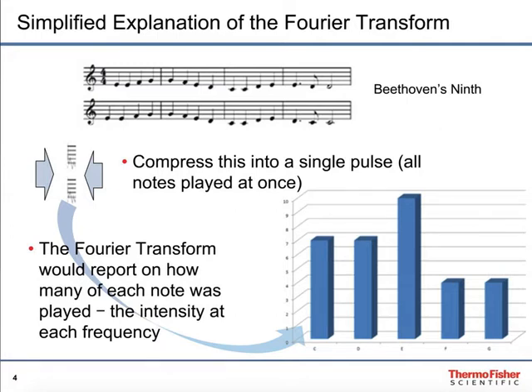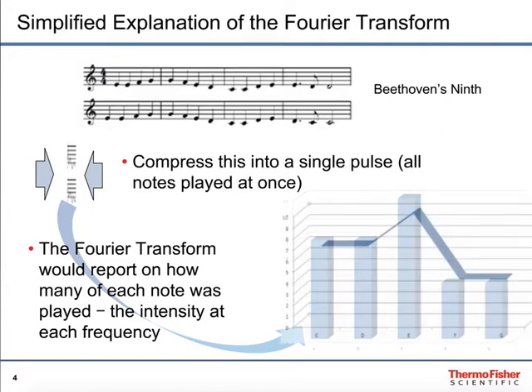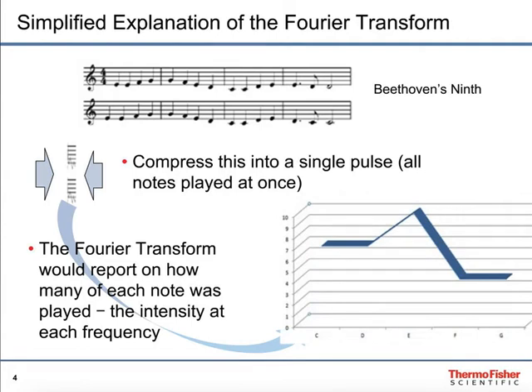Shown here first is a bar graph. You see that there are 7 of the C's, 7 of the D's, 10 of the E's, 4 and 4 each of the F's and G's. Now, if we just show this in a slightly different form, here we see it as basically a single beam, or a spectrum, so to speak, of the different things where you have intensity versus frequency.